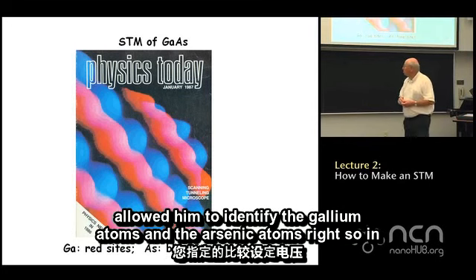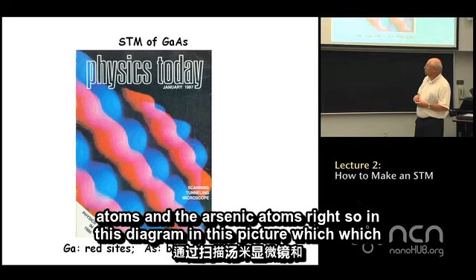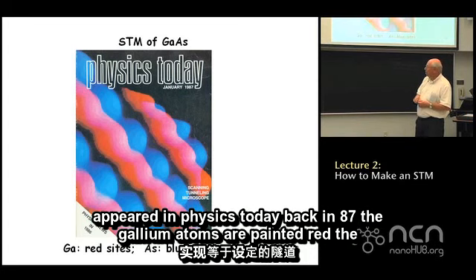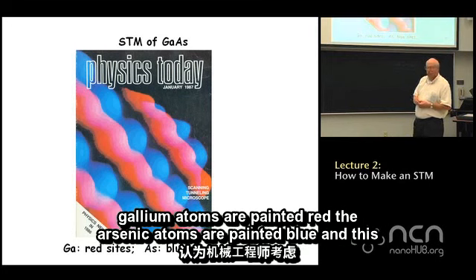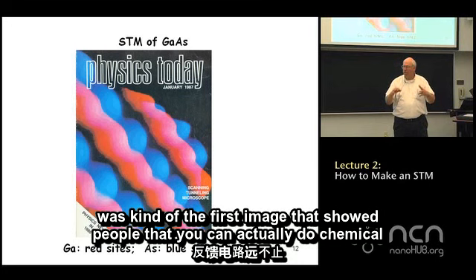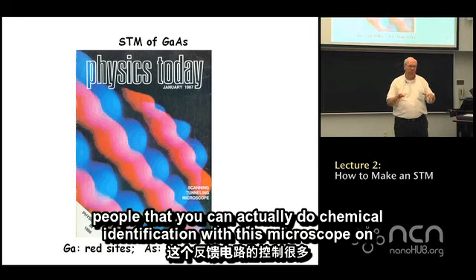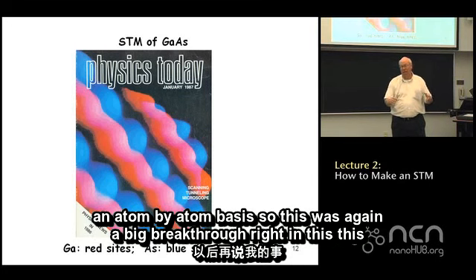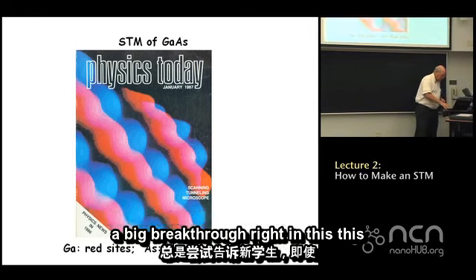So in this picture, which appeared in Physics Today back in '87, the gallium atoms are painted red, the arsenic atoms are painted blue. And this was the first image that showed people that you can actually do chemical identification with this microscope on an atom by atom basis. So this was, again, a big breakthrough in this business, right?